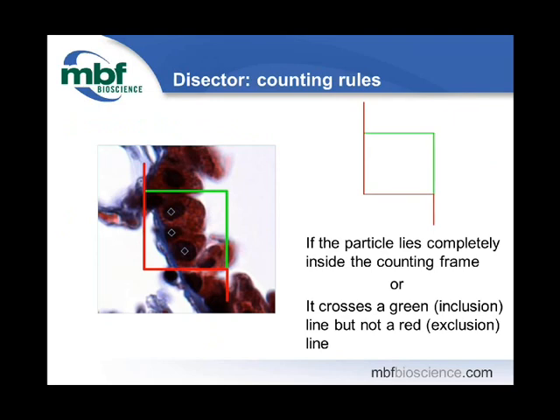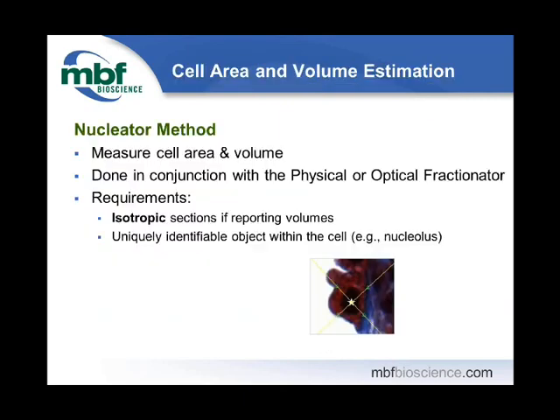On the left is an example of 3 nuclei that are marked in the lung. So in this case, we marked 3 cells in this Disector. This Disector and other rules allow you to follow special rules for this probe, so that we won't count bigger cells more than smaller cells, and we won't overcount cells. We take a lot of pains to count only the cells that belong in this Disector, and therefore we won't be overcounting the cells.